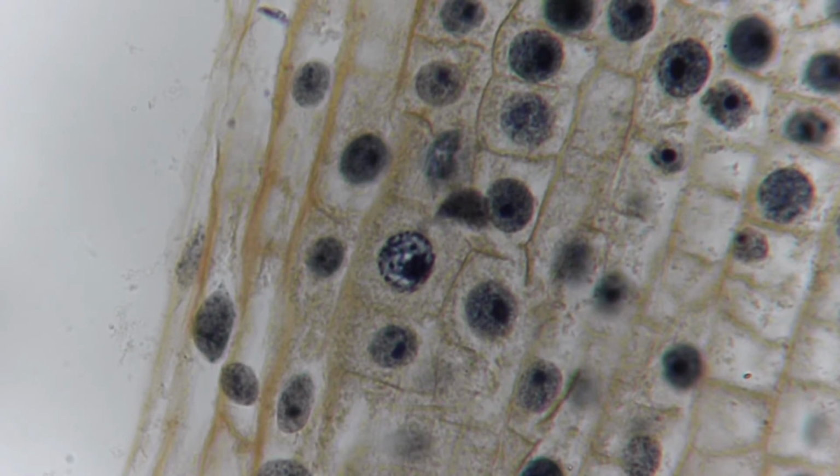That it's got the dark purple spot that you don't draw or just ignore. It's round, but there's no membrane present. And if you look at procedure 2, these are the parts that you need to be able to see and identify. So in procedure 2, it has cell wall, and that's just that border around it. It also has cytoplasm, and that's just the kind of pink grainy stuff outside. And all of those purple little chain-looking things, those are the chromosomes.